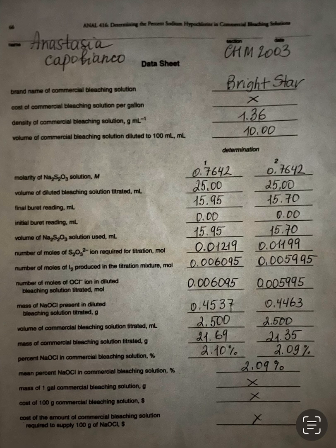What we do not need, I marked with small crosses, so you know that you will not be required to calculate them. My density of the commercial bleaching solution is 1.36. You have that data already written in your lab manual. Please take a look over there and confirm that the units for your density are grams divided by milliliters.